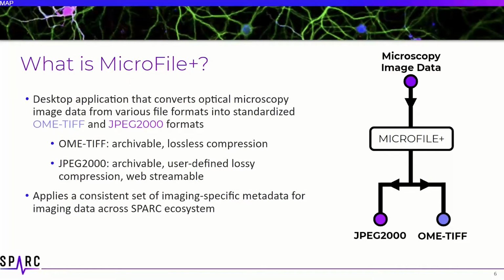Like Aiden said, MicroFile Plus is going to make it easy to ensure that the image data in your experiment meets these SPARC requirements. The application itself ingests source microscopy image data and converts these files to both OME-TIFF and or JPEG 2000.